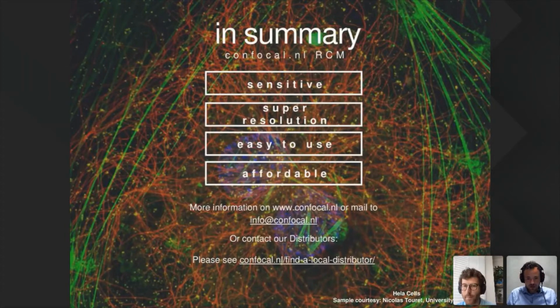Indeed, the multi-split will cut the camera for individual regions. If you take out the multi-split, you have the entire field of view, of course. And Cairn also has the multi-cam approach. If you have a little bit more money, then you can add 4 cameras, and they can pick up different parts of the spectrum. This will also work with RCM. Then you have the entire field of view, but it's a more expensive solution, of course, because you have to utilize 4 cameras instead of 1.